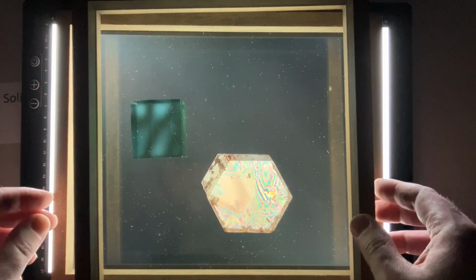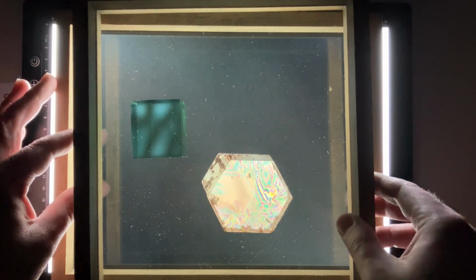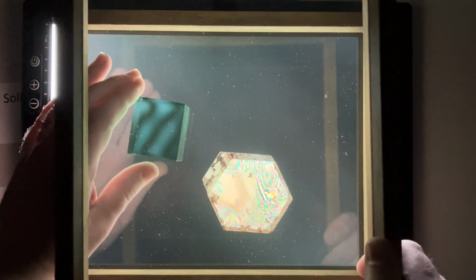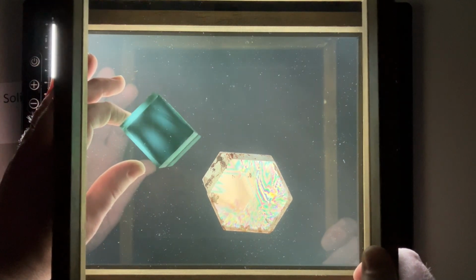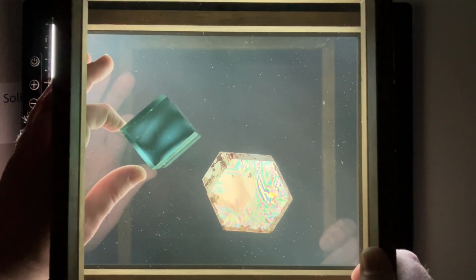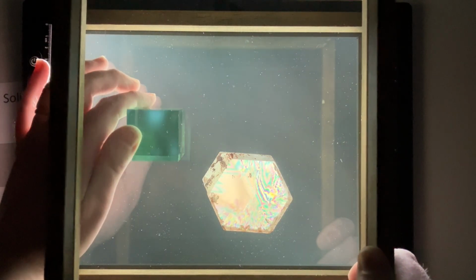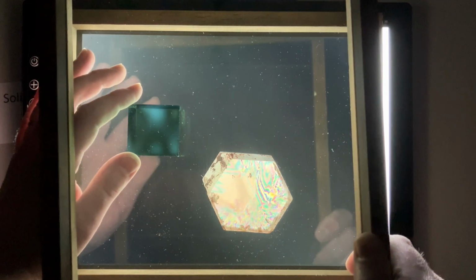The glass primarily stays dark, but does have a couple bands of light running through it. Let's check out what happens when we rotate our cullet glass specimen with the crossed polarizers and take a couple different views through our sample. Our glass lets a little bit of light through, and we can also see these interesting waves of light and dark as we rotate the glass.